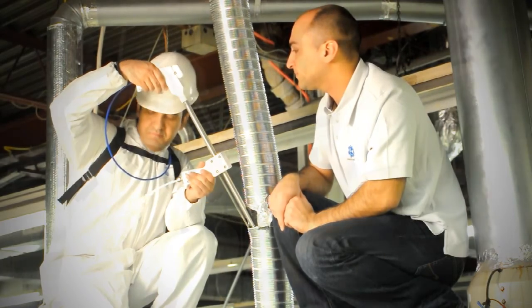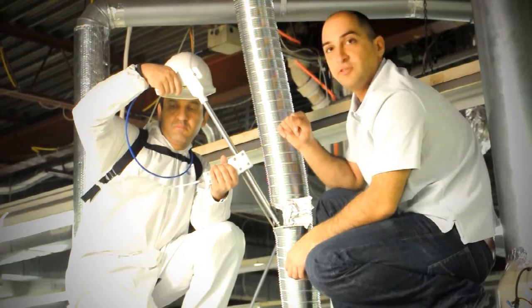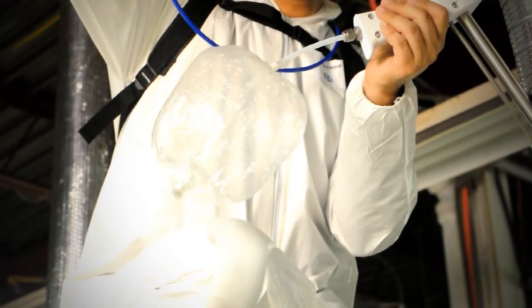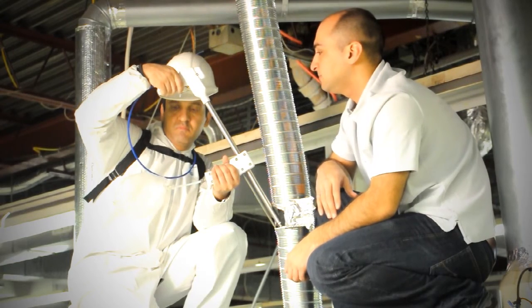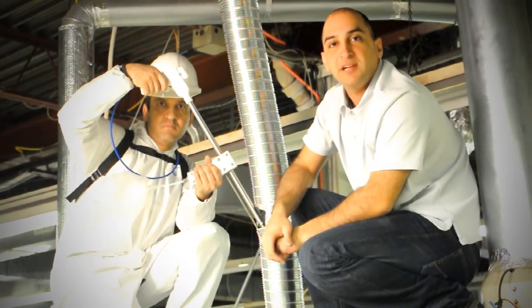When you're ready, you can start. He presses the button, the air starts to go through the probe, pick up the sample, and put it back into the bag. Now we have a diluted sample, 40 times with nitrogen.